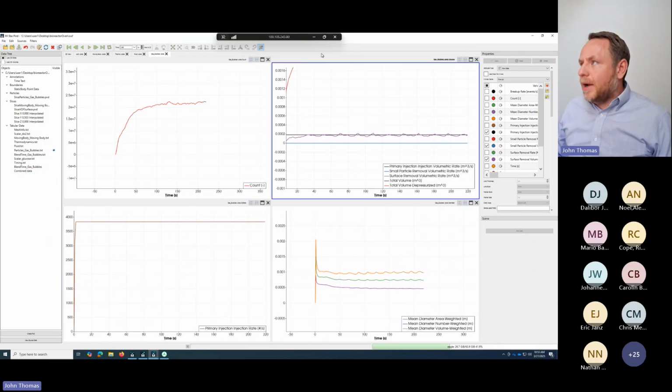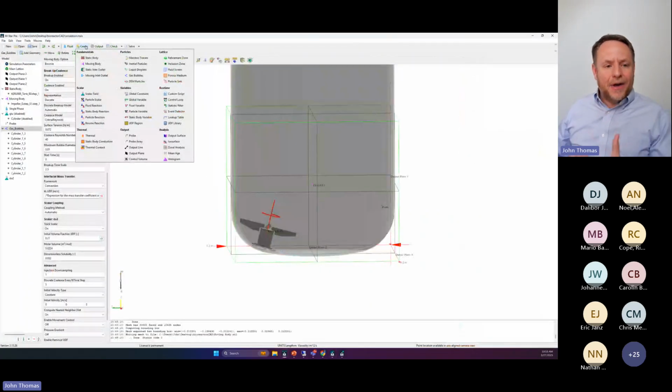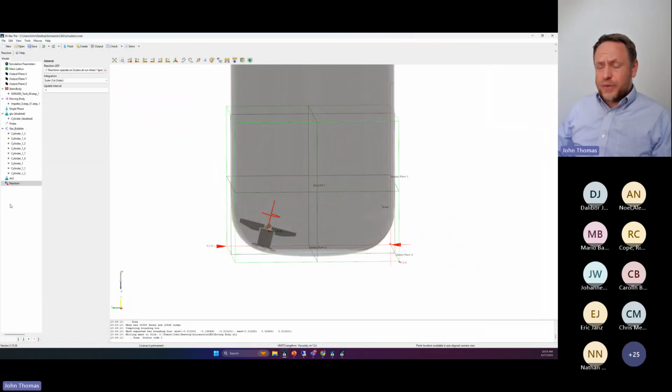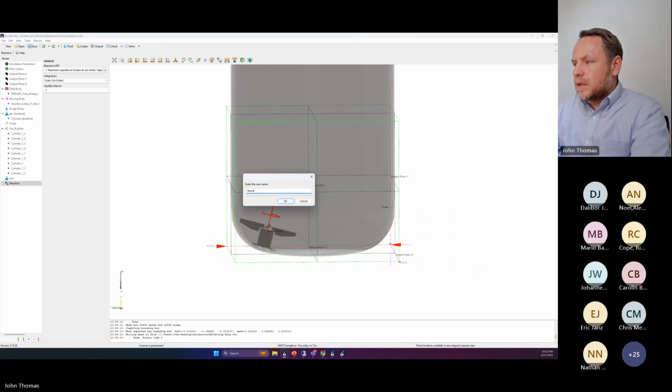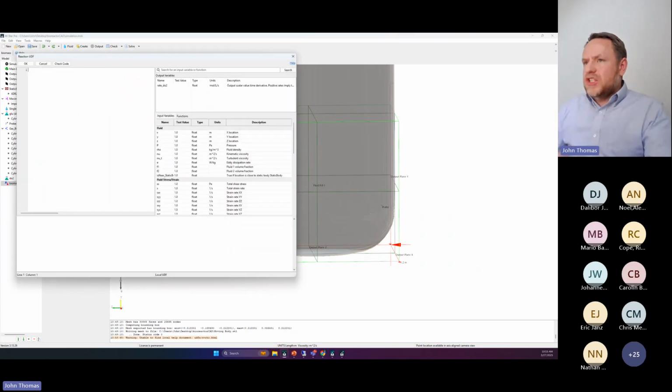So if I go to my model, let me go back over this guy here. I can also add biomass, and I'll model that via an ongoing chemical reaction. So I'll add a fluid reaction here, and I'll call this a biomass. And I'm just going to say that the effect of the biomass is to consume oxygen.